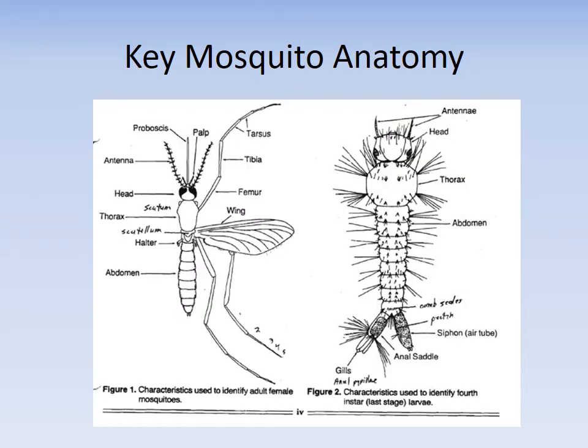There are some great pictures showing you the mosquito anatomy. So not only is it adult, but it also has larvae. I would focus on adult at first. Once you get good at it, then you can jump into larvae. Both are extremely fun. And so here are some key characteristics. It's steering you into a particular portion of the mosquito. If you don't remember what that is, you can go through these pages.